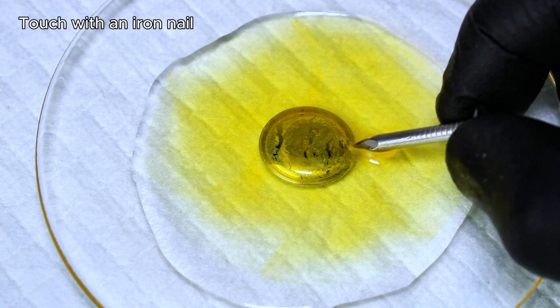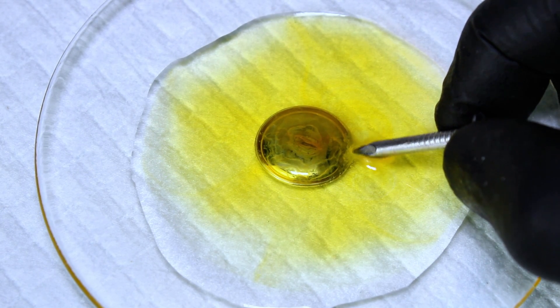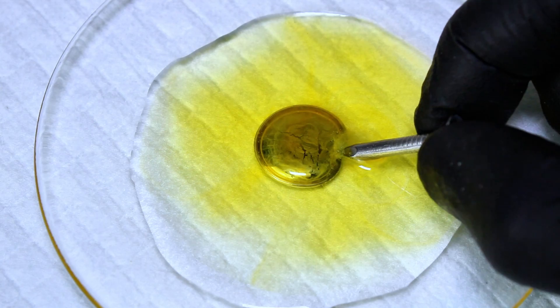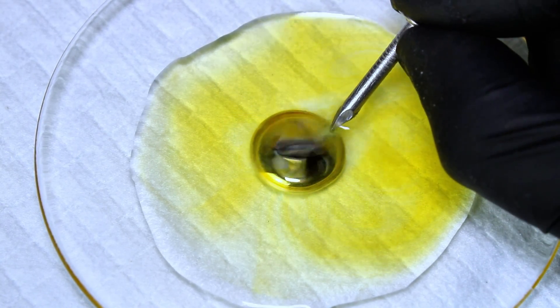When I then touch the blob with an iron nail, the oxide layer disappears and the blob suddenly contracts. When the nail is removed, the blob relaxes and a thinner oxide layer begins to form. This can be repeated several times, and if the nail is positioned just right, the blob begins to oscillate like a tiny beating heart.